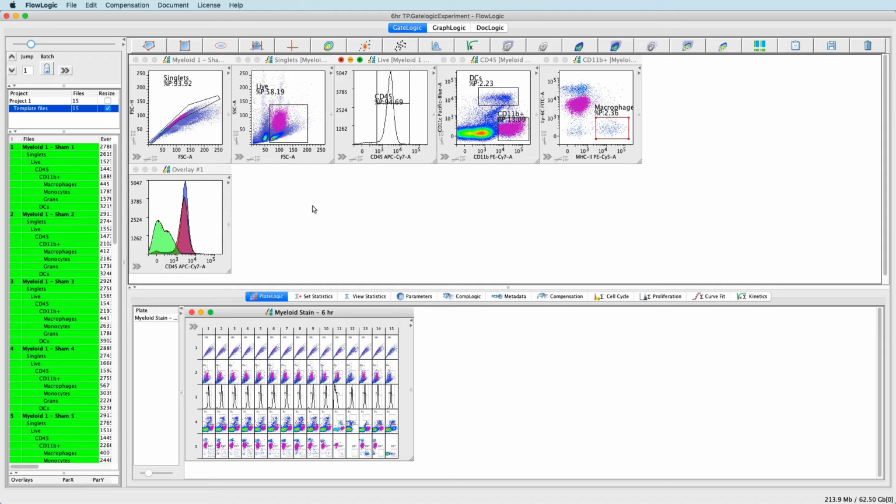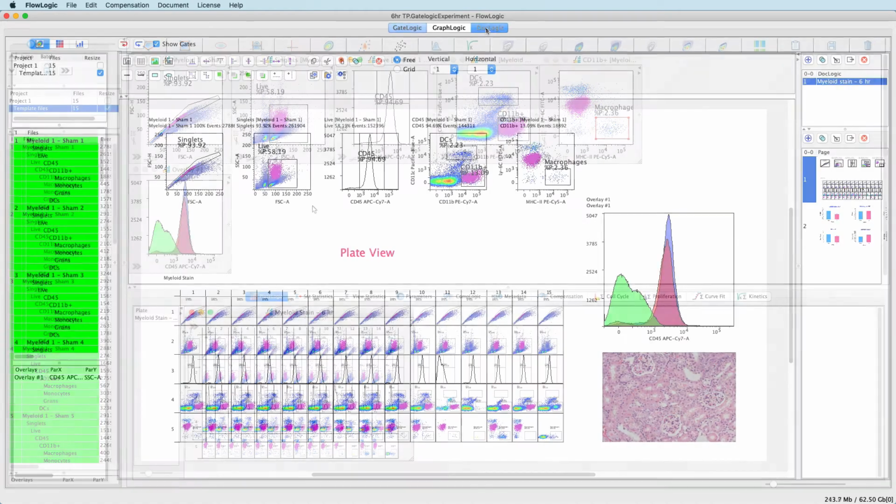This is because if there are too few or too many files in the folder, FlowLogic won't know how to handle the extra files. So it is worth considering when you are building a template to save it with the maximum number of files that you think you will be analysing. It is always easier to delete the files and linked components once the template has been applied.